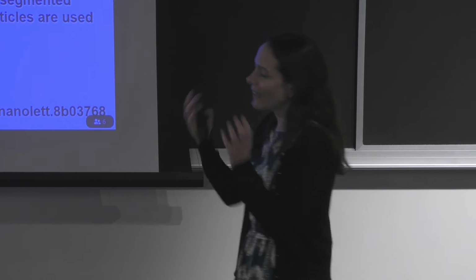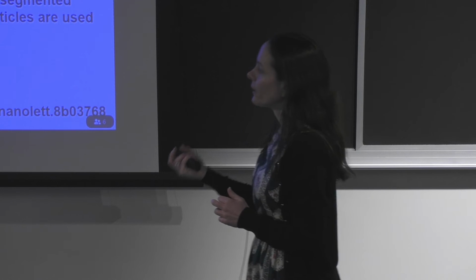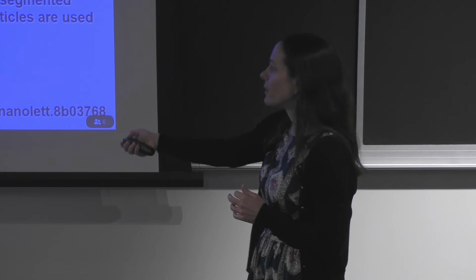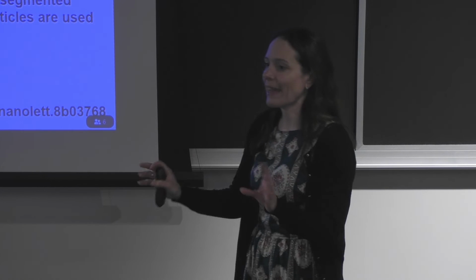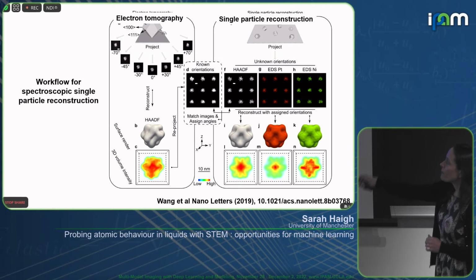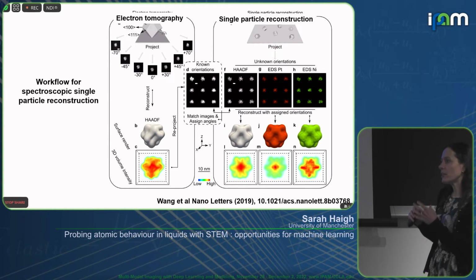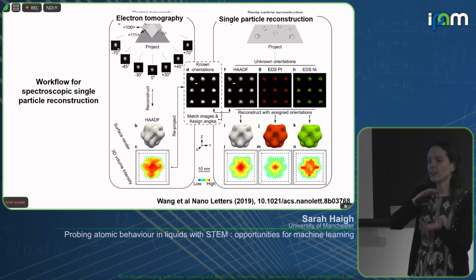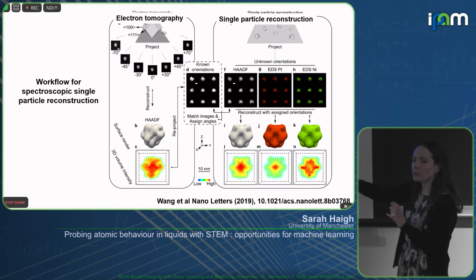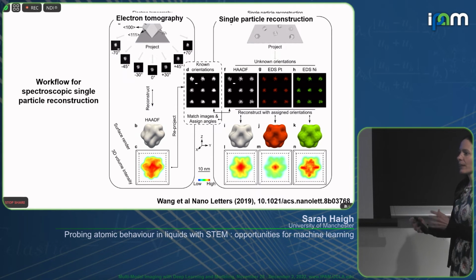And so you had to down select through the particles, and his approach was to say, okay, well, I'll just take the nanoparticles that have a composition of roughly 60%, and they have a size which is a little bit tighter. We'll throw away the outliers in that case as well. And when you do that, you find that you can use the information in the simultaneously obtained images, but take the chemical information that was acquired at the same time. This chemical information hasn't got enough detail in it to tell you the orientation of the individual particles. But because they're simultaneously acquired, you can just take the registration information from the high-angle annular dark field, use the elemental maps, and combine them to get an average elemental map for that nanoparticle section.